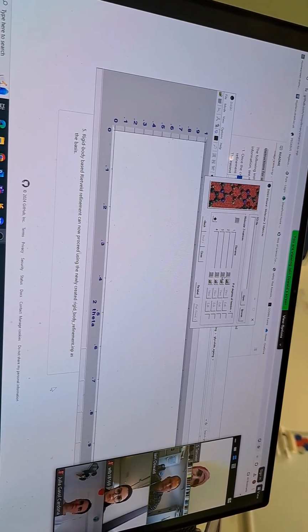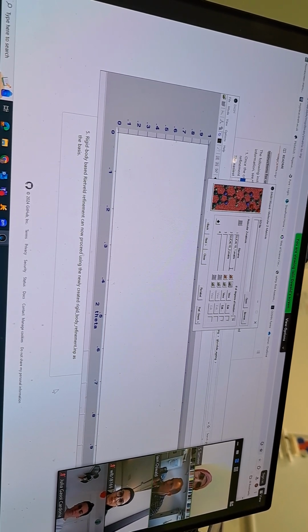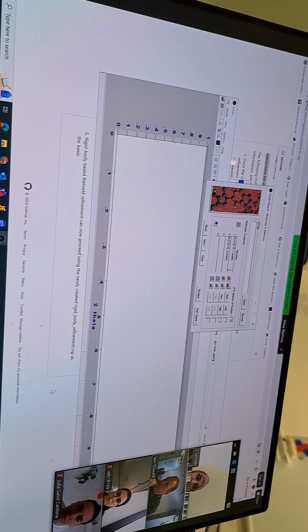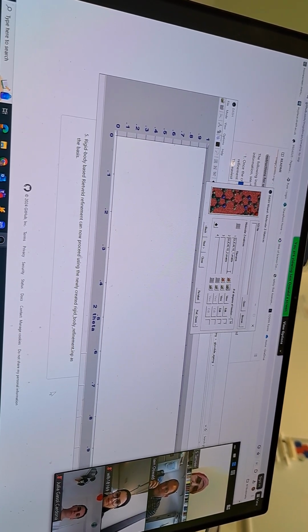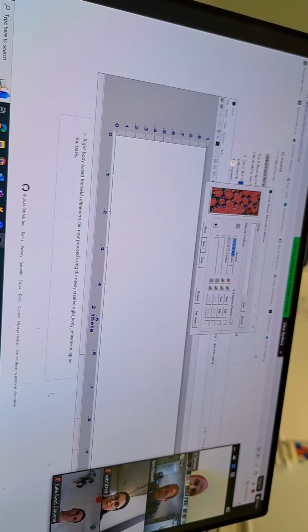Okay, and so by inputting that CIF file, you can see that it's split out. There are two independent molecules in the CIF file, so there are two molecules output here. Does that make sense? Yeah. So you can see that there's a Z matrix that has been produced.